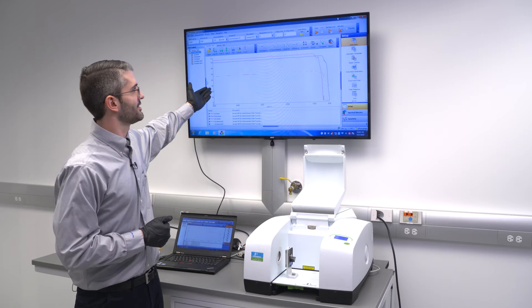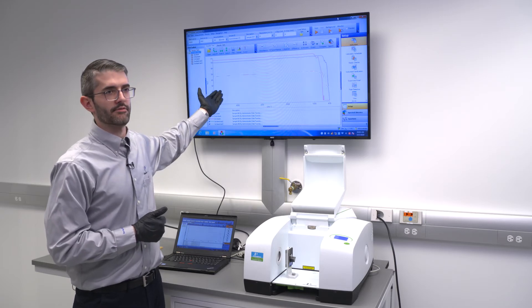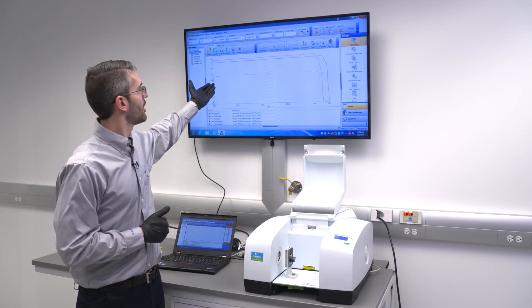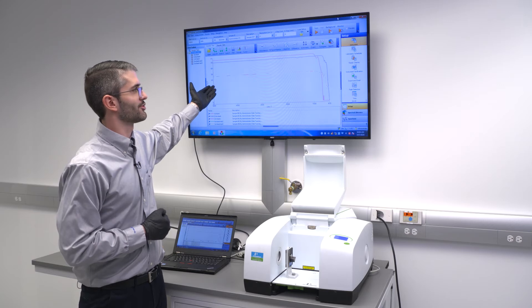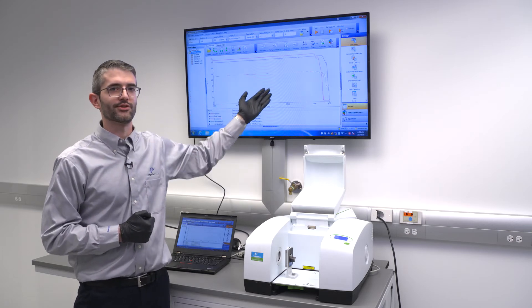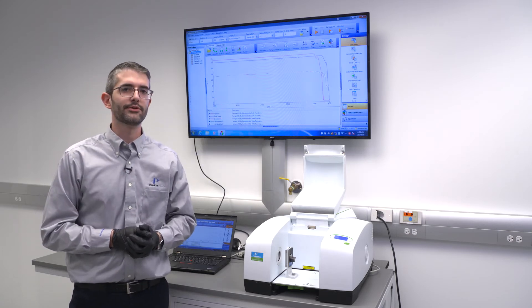However, Perkin-Elmer's AVC technology, or atmospheric vapor correction technology, automatically subtracts these spectral features out of the measured spectrum, requiring no user intervention to provide a high level of accuracy with minimal effort.